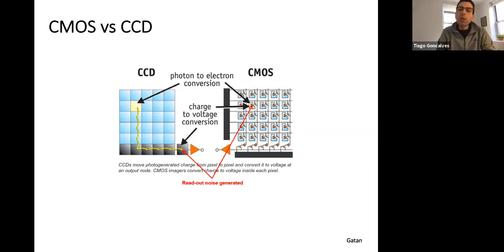You can actually saturate both. You usually expose, and I'm going to go into that. You expose your CCD, your image, for a certain amount of time, and then you read it out. And if that is more than the size of your bucket, if you imagine there's a bucket where you collect its charge, then you're going to be saturating. And there's a certain amount of charge that these pixels can hold.